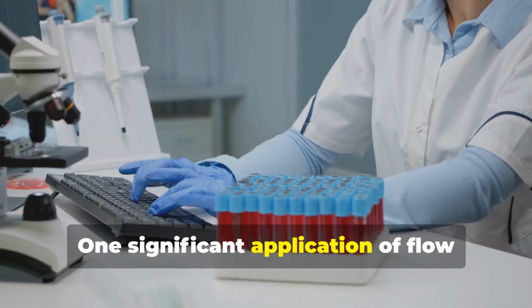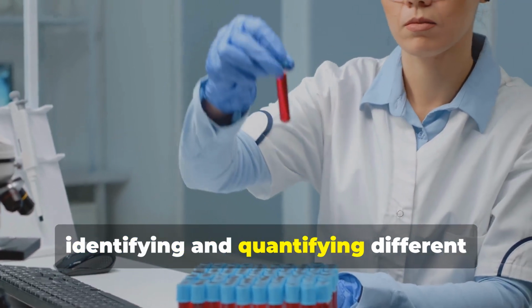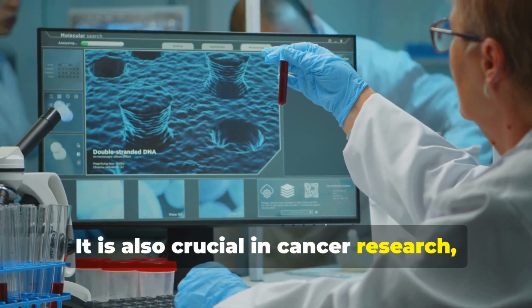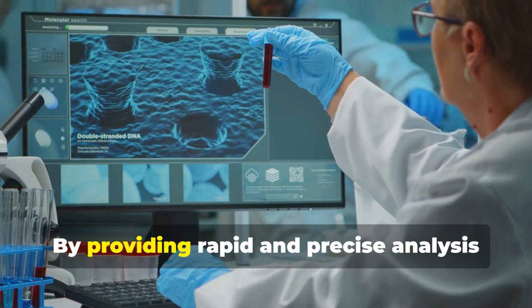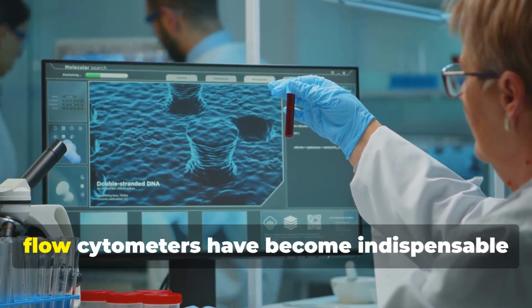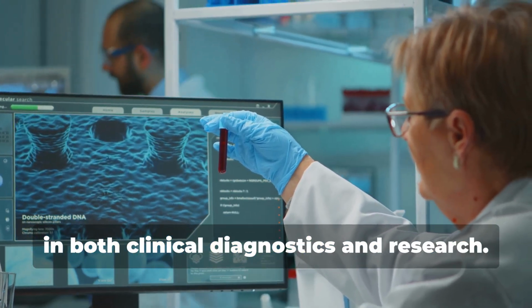One significant application of flow cytometry is in immunology, identifying and quantifying different types of immune cells. It is also crucial in cancer research, helping to detect and classify cancer cells. By providing rapid and precise analysis of thousands of cells per second, flow cytometers have become indispensable in both clinical diagnostics and research.